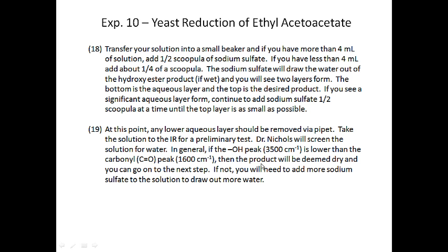And then we're going to test the product for water using infrared spectroscopy. Since this week Dr. Simmons is in Hong Kong, I'm going to be in charge of all the labs, and so I will be screening these products for the water.